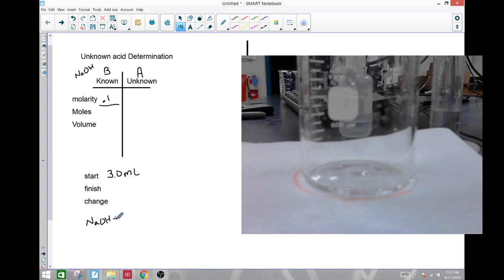NaOH plus HCl will form NaCl plus water. So it's reacting with the HCl in a 1-to-1 fashion. Okay. So either way, my objective here, we've done a bunch of stuff with titrations already, but a few things you've got to know are what is my known concentration, and how much of my unknown do I want to use in the beaker below. That's kind of an important value.